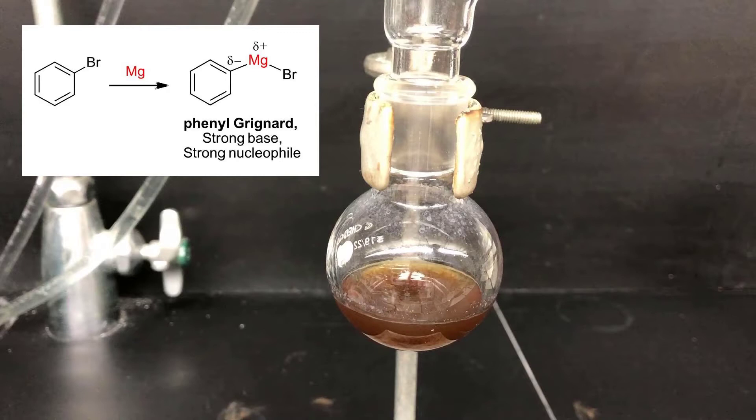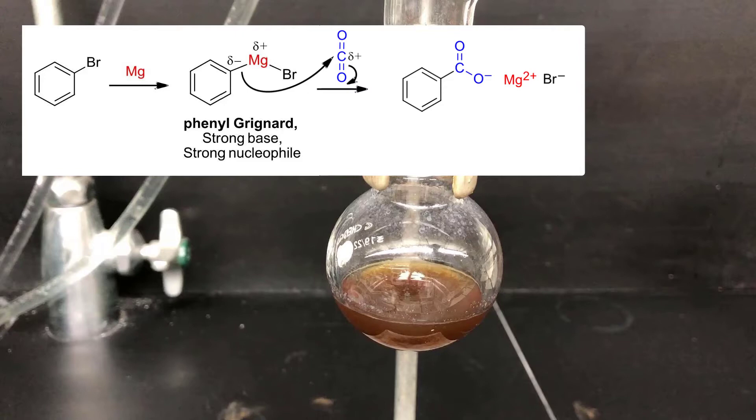Now, I have a flask with phenylmagnesium bromide dissolved in ether. Next, I'll add this solution to solid CO2, dry ice, and the Grignard reagent will attack the carbon of the CO2 and form a new carbon-carbon bond to make a magnesium carboxylate salt of benzoic acid.